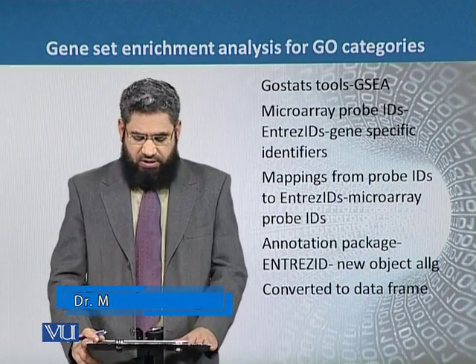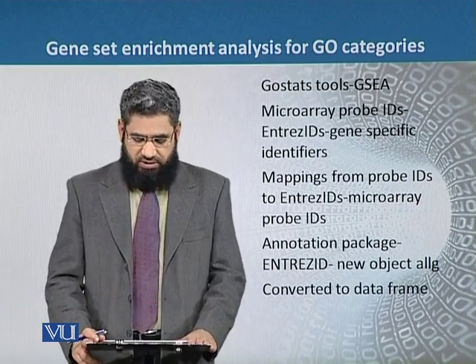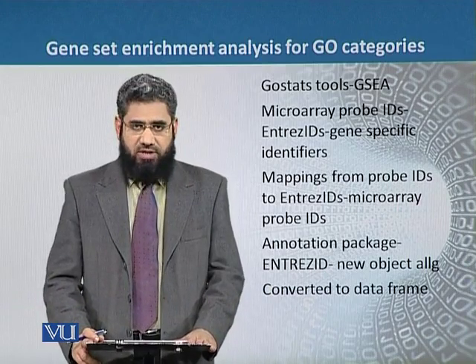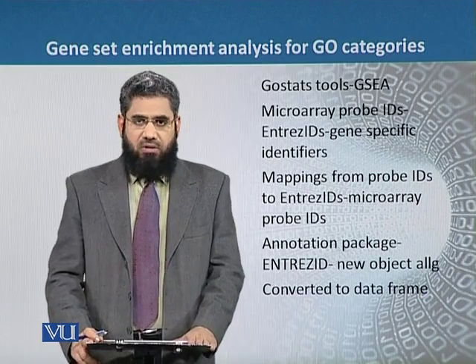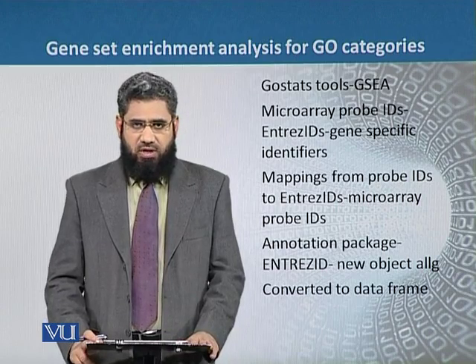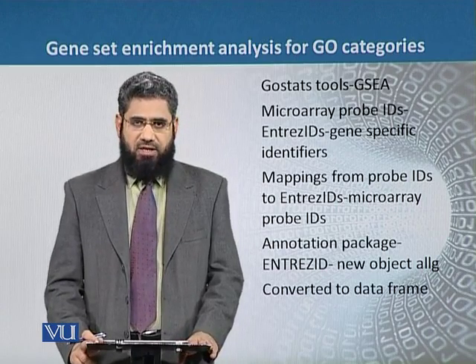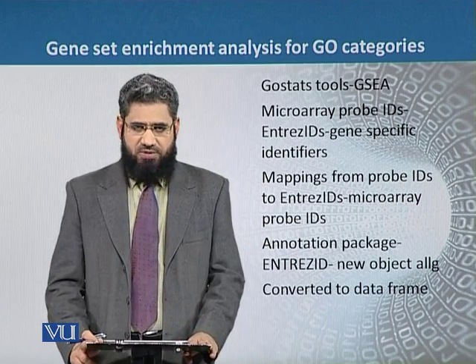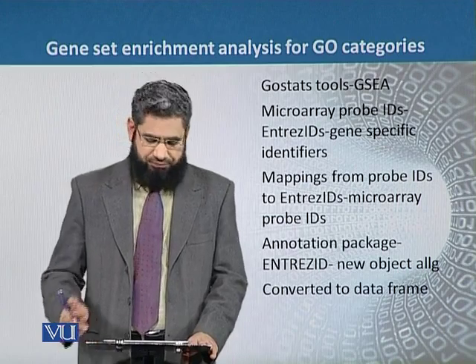First, we have to convert the probe ID into the Entrez ID. Then, using the annotation package, the Entrez ID is converted into a new object ID, that is ALLGs. And in the last step, the ALLGs object is then converted into a data frame.